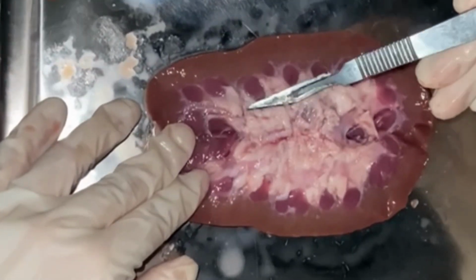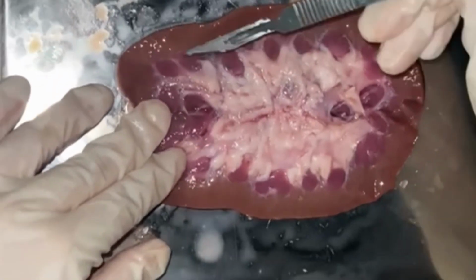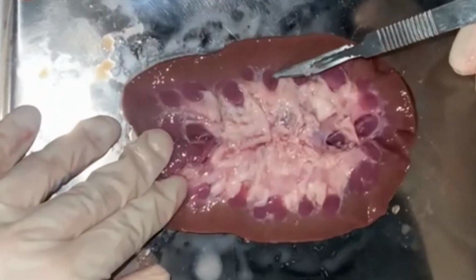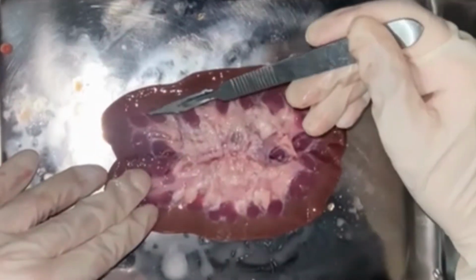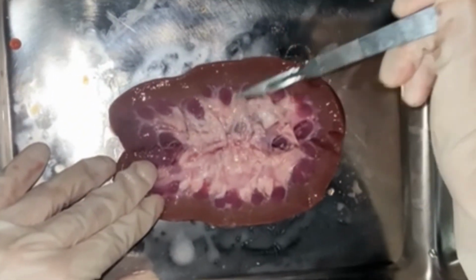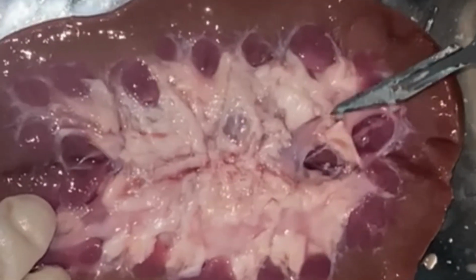Each segment that you can see in this region is a renal pyramid. They contain the collecting ducts, which collect urine from the kidney tubules of the nephrons in the cortex. These are the renal columns, which separate the renal pyramids and provide support to the kidney structure to facilitate the efficient flow of blood and urine.